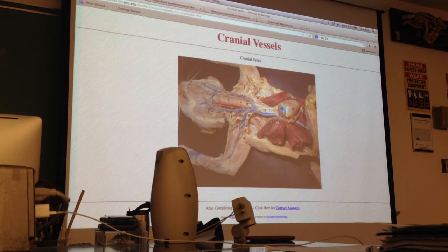Now, if we were to pin anything in this region between the thyroid and the cricoid, those two borders, and ask you to identify the space, then we'd be asking for the larynx. Because those two cartilages are essentially the structures that we can see externally that make up the space in the respiratory system. So the tube itself, the inside of the tube, that's the larynx.